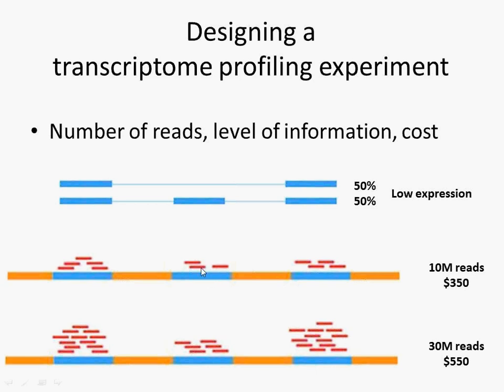So it depends on the level of information that you need to have and the money that is available for that experiment in order to order the right number of reads.